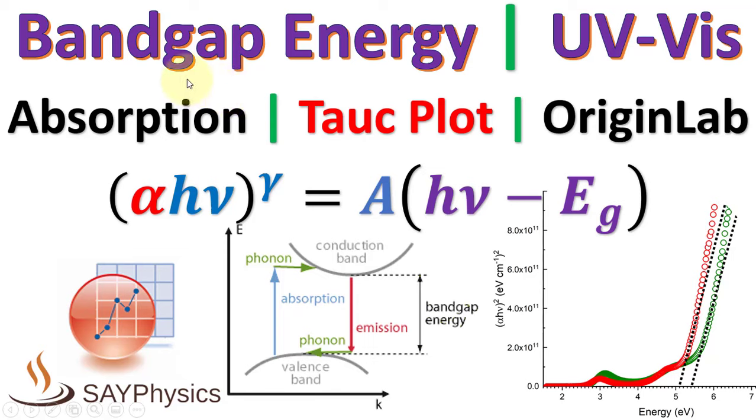In this video we will discuss how to calculate the band gap energy from UV-Vis absorption data using Tauc plot in Origin.